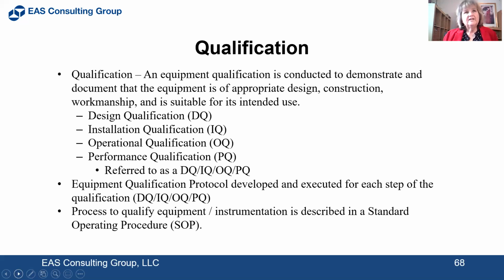Okay, so your equipment and your instruments have to be qualified. An equipment qualification is designed to demonstrate and document that the equipment is of appropriate design, construction, workmanship, and is suitable for its intended use. There is design qualification, installation qualification, operational qualification, and performance qualification. These collectively are often referred to as DQ, IQ, OQ, PQ.